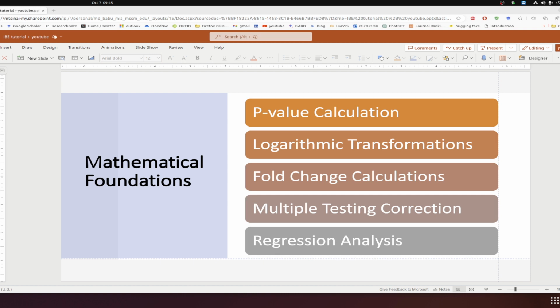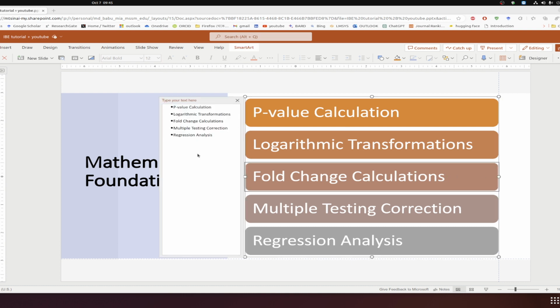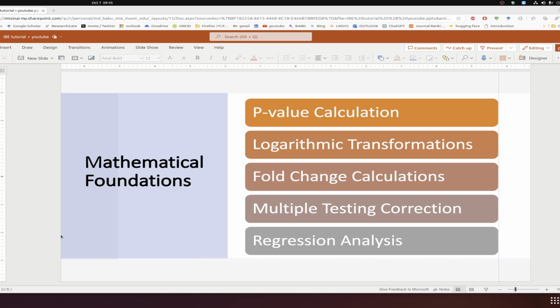So you use the results you are finding, you actually do a log transformation of them for better visualizations, and to calculate the fold change between both of them. If you want to see the fold change calculation, usually if you see two conditions, you'd simply do condition A divided by condition B, and that will be the fold change calculation.